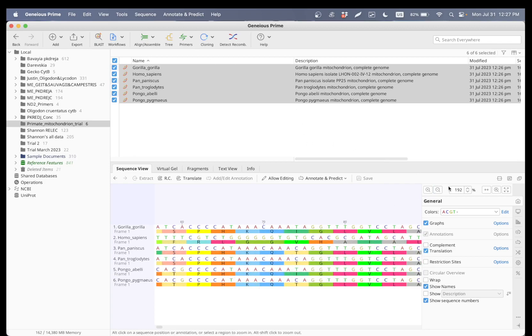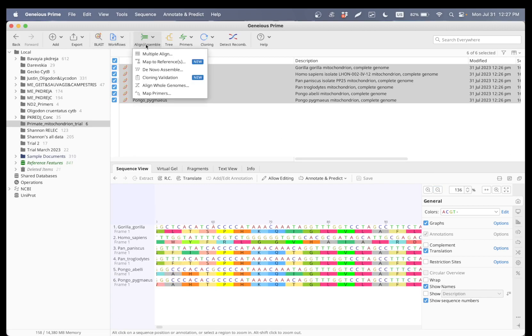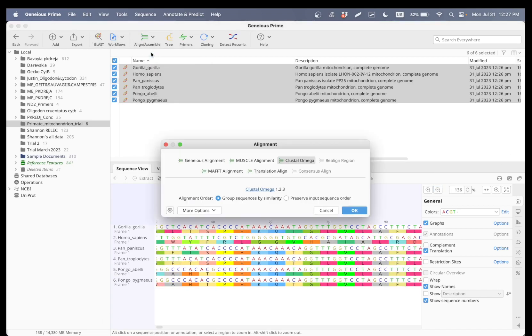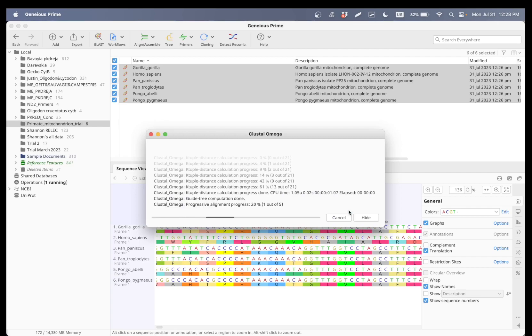Let's go ahead and align them. Under multiple align, we have a couple of options. Geneious alignment will probably take 15 minutes with six specimens. You can do MUSCLE alignment or Clustal Omega. I'm going to go ahead and do the Clustal Omega — it should take about a minute.